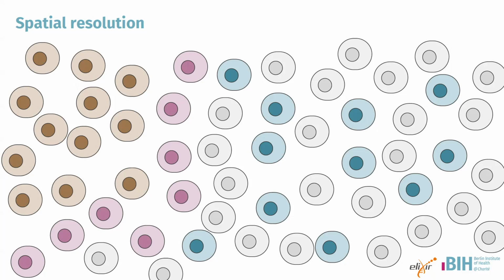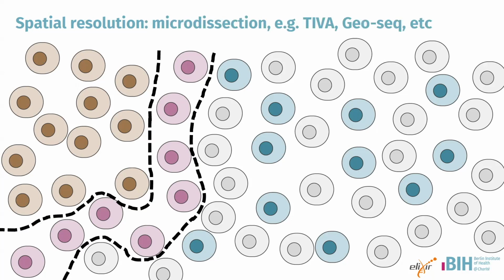region here. So if you want to do a very cost-effective methodology, knowing your tissue, you could actually do something where you do some sort of microdissection-based spatial transcriptomics. So you know these cells are roughly the same. So as this layer, you can use a laser or some other method to cut out these cells and profile them at the bulk level and analyze those.